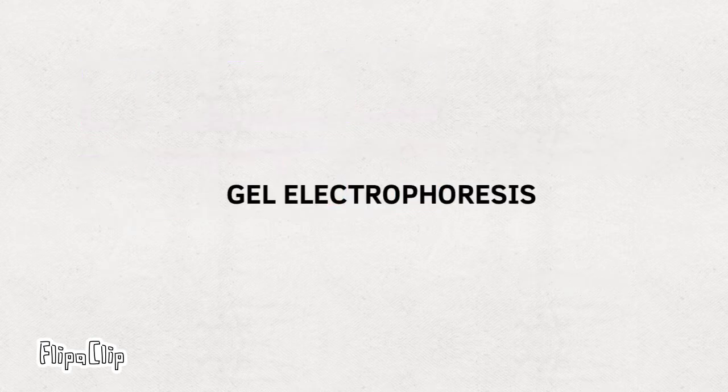So to confirm that the PCR was successful, we are going to use a gel electrophoresis. The gel electrophoresis simply shows us the length of the many DNA fragments that we created.